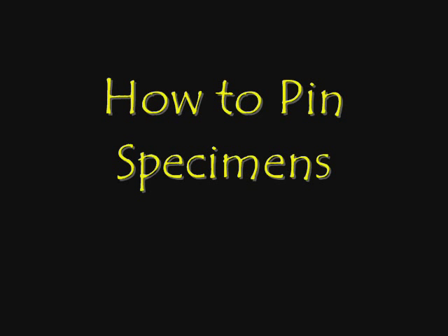This video is about pinning bees and wasps. We're going to show you pinning techniques. We'll have another video that covers gluing techniques for very small specimens and dried specimens. The basic idea is that we'll show you how to insert a pin, where to insert it, and the height of a bee pin on the specimen.